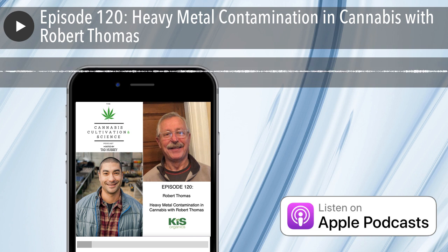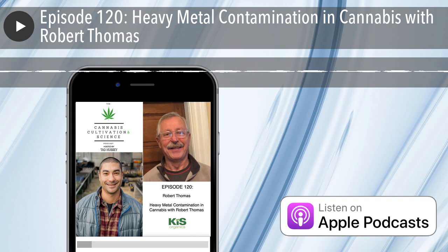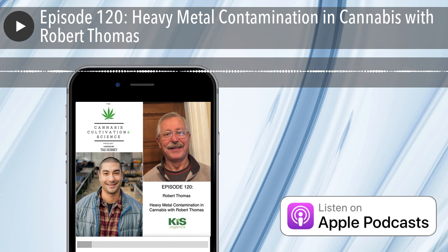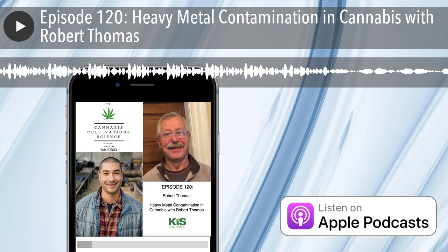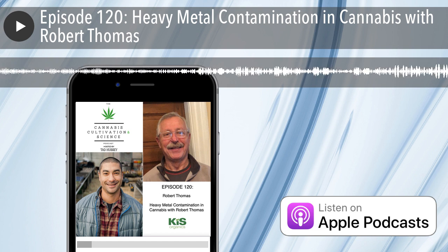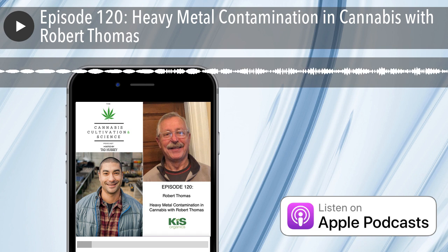Yeah, it does. The only way I can answer that is that I've been in this field, trace element and heavy metal analysis, for almost 50 years. And you see industries go through a logical phase in trying to understand where heavy metals play a role in that industry. You'll find that industries or application areas that decided to be proactive with regard to looking at heavy metals, obviously the EPA is a big incentive, for drinking water companies and companies that are involved in the environmental business.